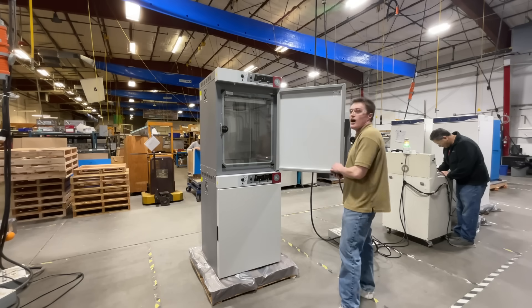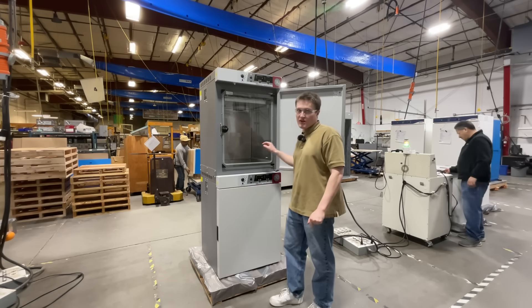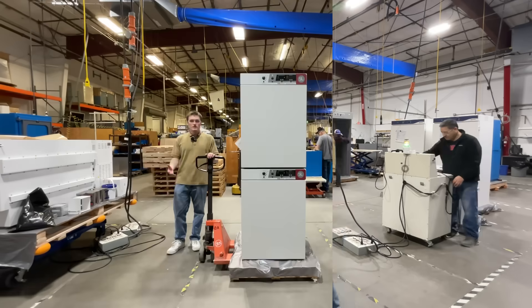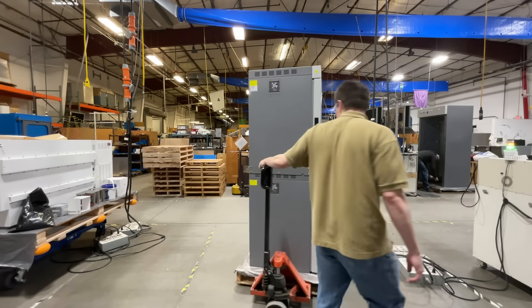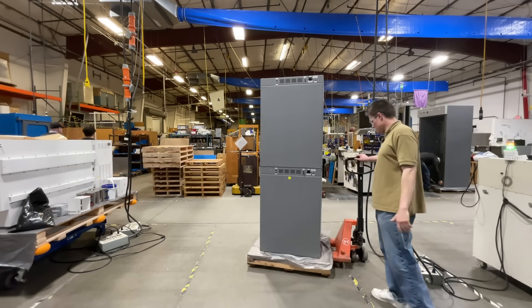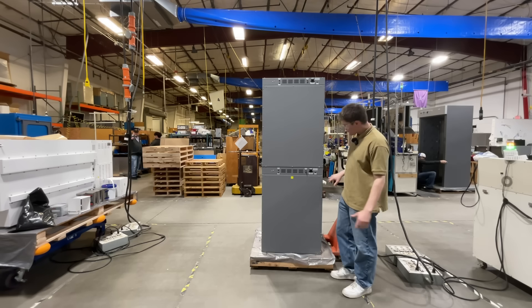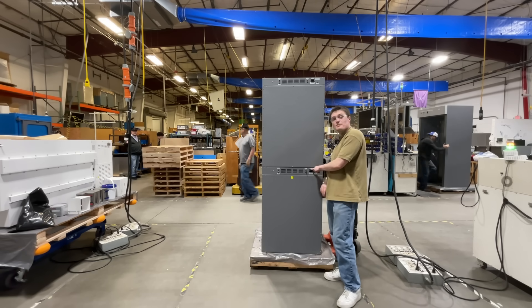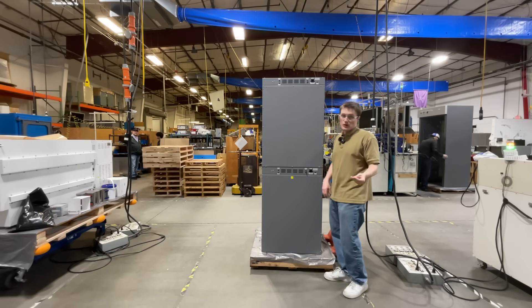First, a door-mounted heating element, as well as a door rim-mounted heating element. Now let's take a look at the back of the unit. Coming around to the back, you'll see a couple different features. These are identical up top and down below. First, you will see the main power inlet. This must be connected to a properly grounded electrical outlet using the included power cord with the ship kit.